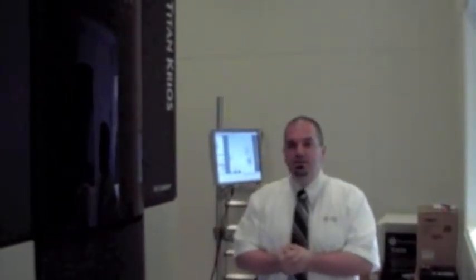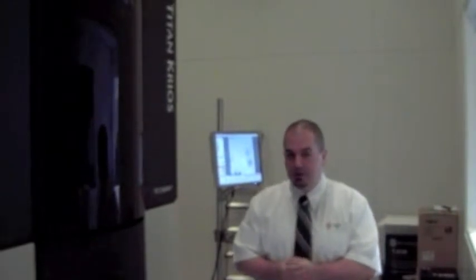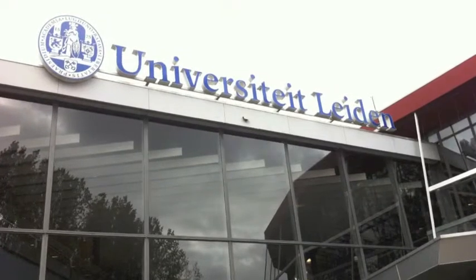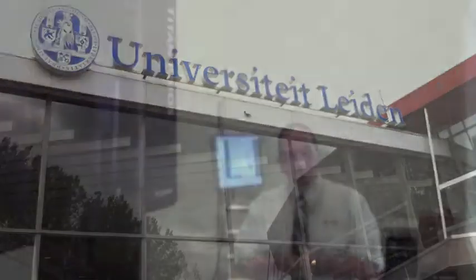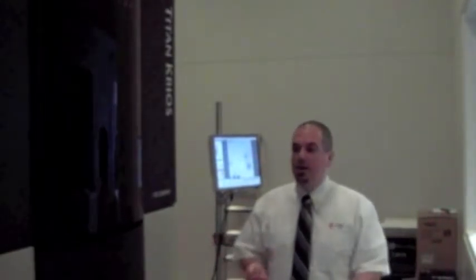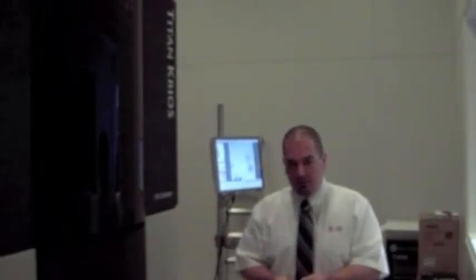Welcome to NeCEN. NeCEN stands for Netherlands Center for Electron Nanoscopy. NeCEN is hosted by the University of Leiden in the Netherlands, but users and researchers from all over the world are welcome to apply for beam time and come and use our microscope.